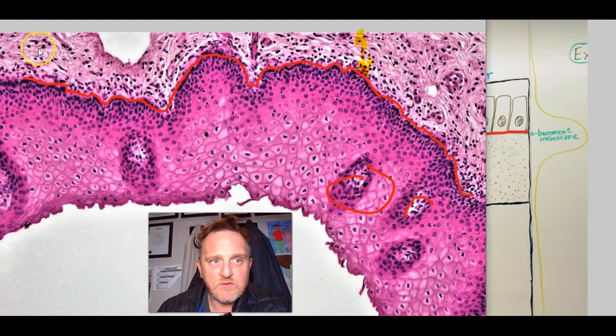The connective tissue inevitably stains a much lighter color, and the reason for that is this is the connective tissue, the stuff at the top of the image, because there's less nuclear arrangement, less cells, and less uniformity or uniform arrangement of the cells compared to the epithelium. So this is the lining epithelium.